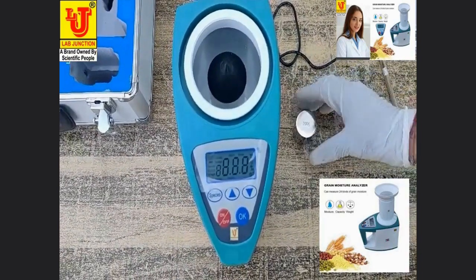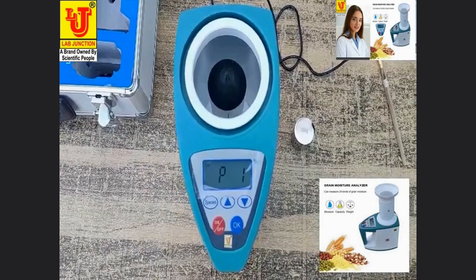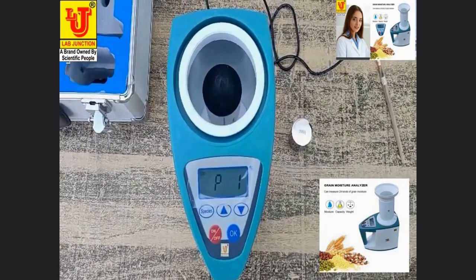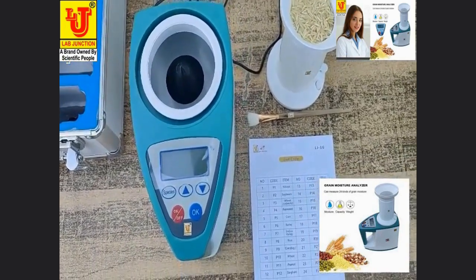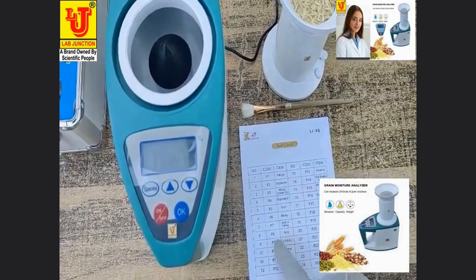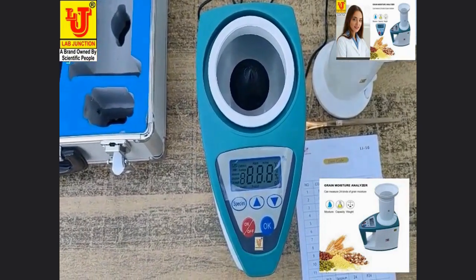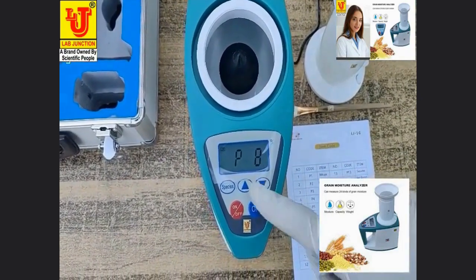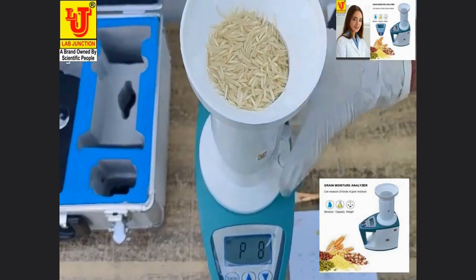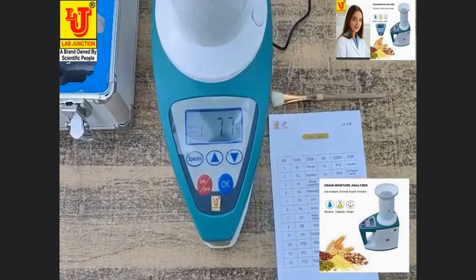Now switch on the instrument — measuring starts. Select your item code value and release the grain material into the chamber. Directly it shows the moisture in percentage. Now I am measuring rice moisture. Rice moisture code is P8, already selected. Attaching vessel, pressing this key — directly, rice moisture comes: 7.7%.